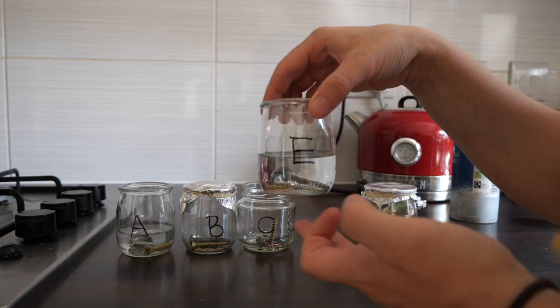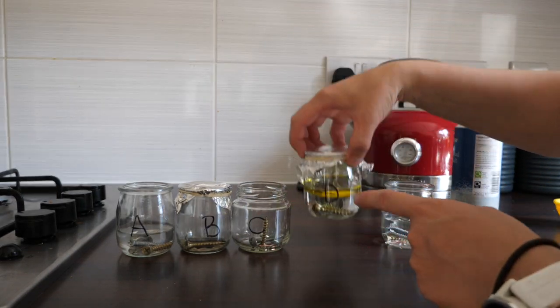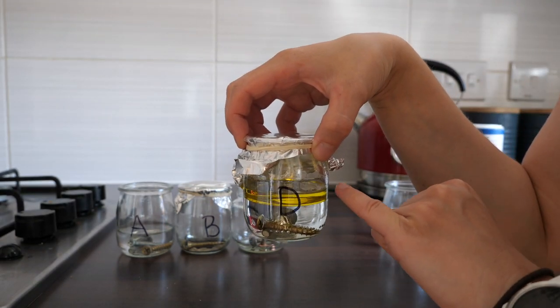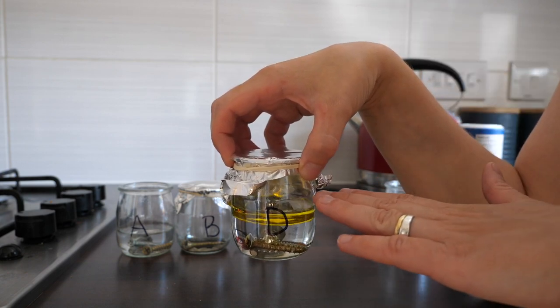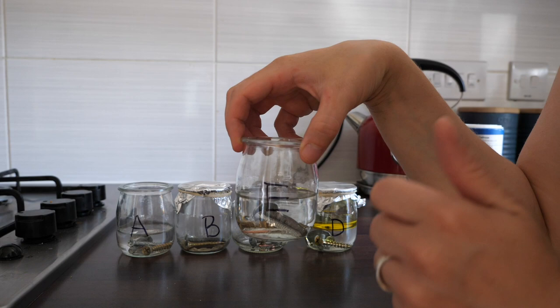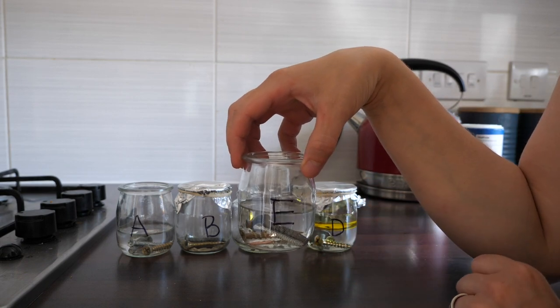Into E — oh hang on, I've got them out of order. Into D I've got water that I've boiled in the kettle. By boiling it I've removed the oxygen, and then I've poured some oil on top so that's sealing it so no more oxygen can get in, and then I've just put a lid on as well. And then finally into E I've got tap water, so it's got water and it's got oxygen dissolved in it because it's tap water, and I've added some salt in there as well.